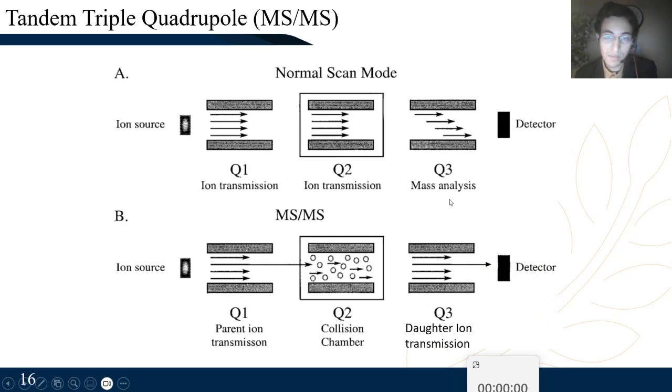Okay, so what is this called? The one I just talked about is called an MRM or MS/MS operation, where you only let a single parent go through. You fragment it using collision-induced dissociation, then you only pick a single daughter ion, which passes to the detector. And knowing the voltage here and there, you can work out the mass-to-charge ratio of whatever gave the signal.